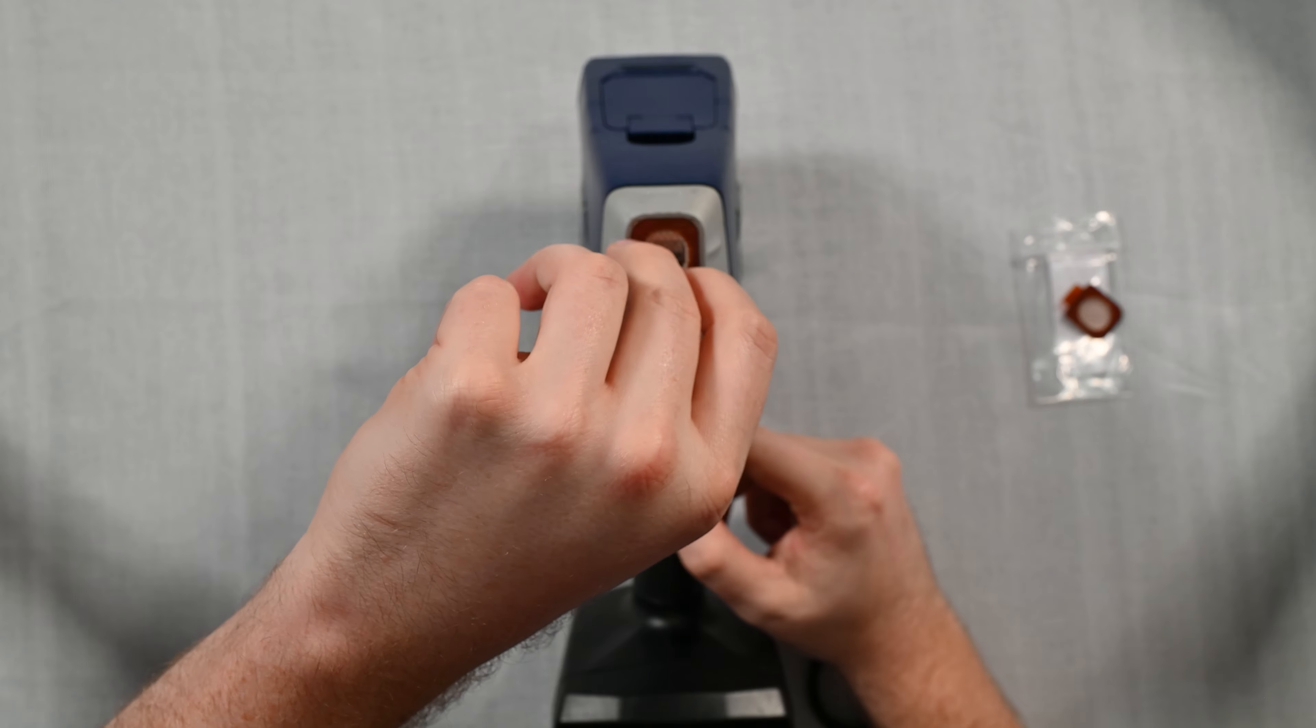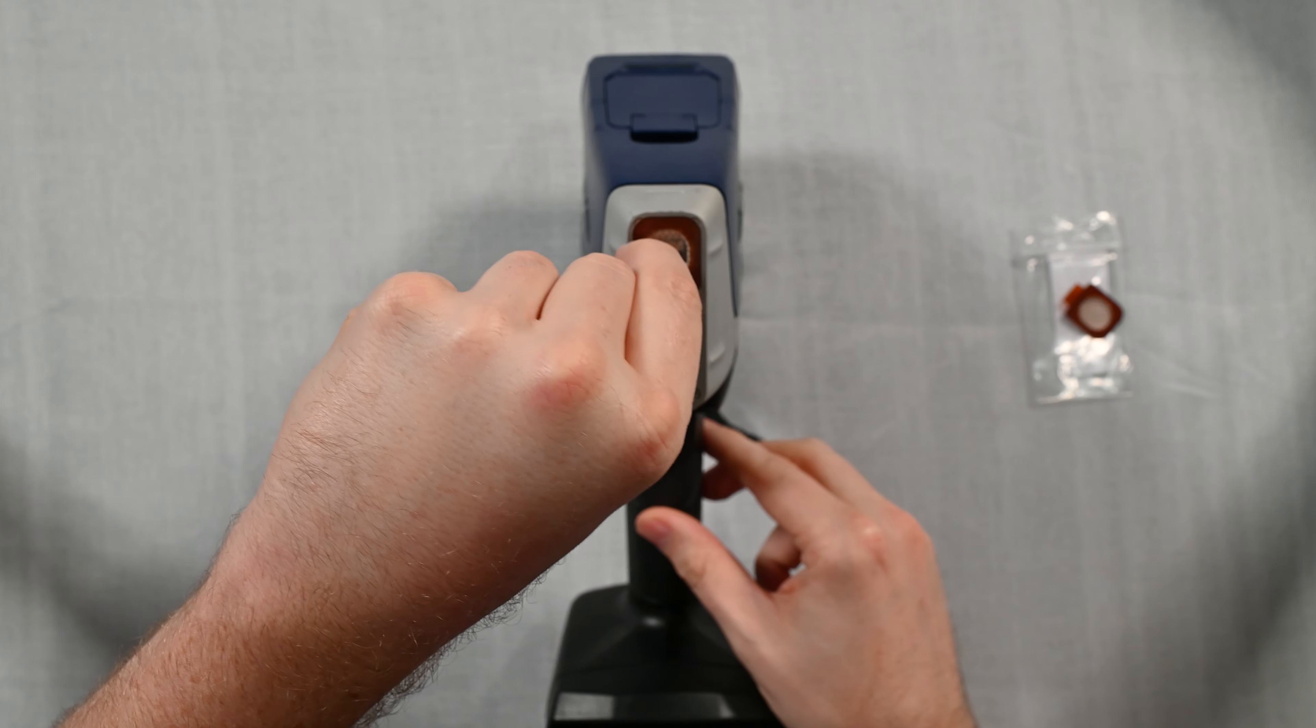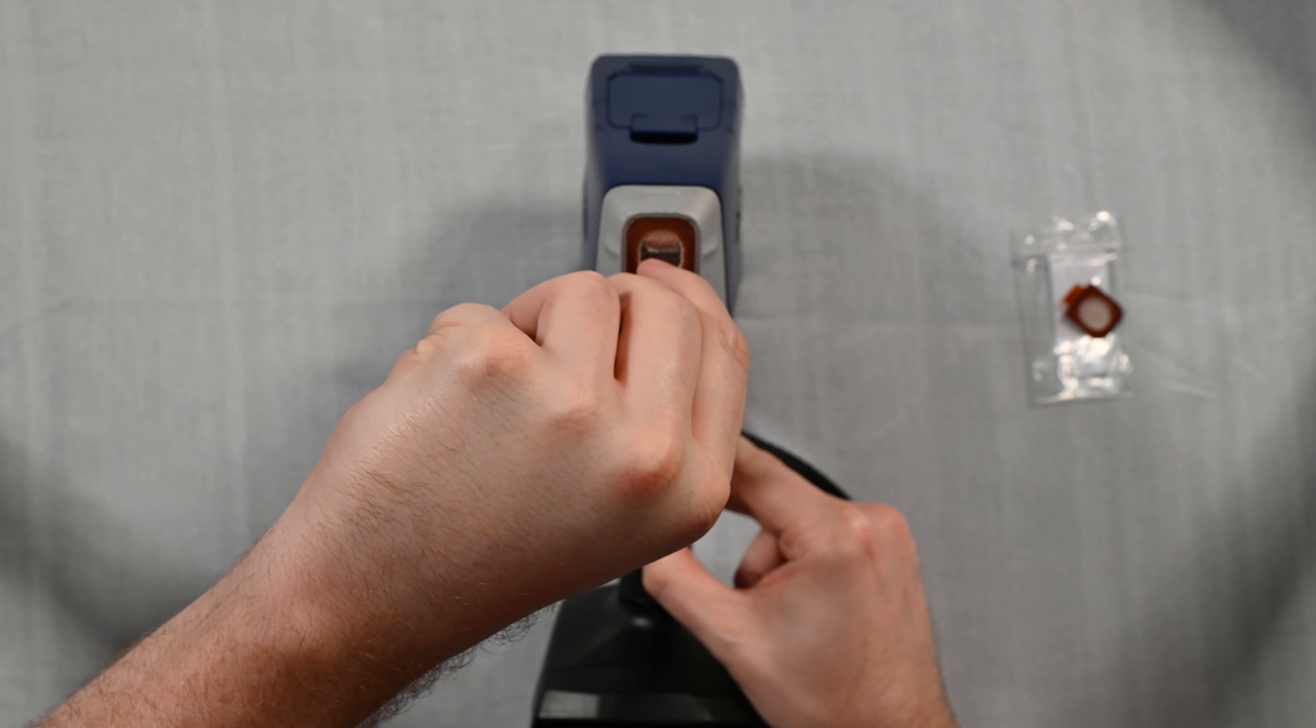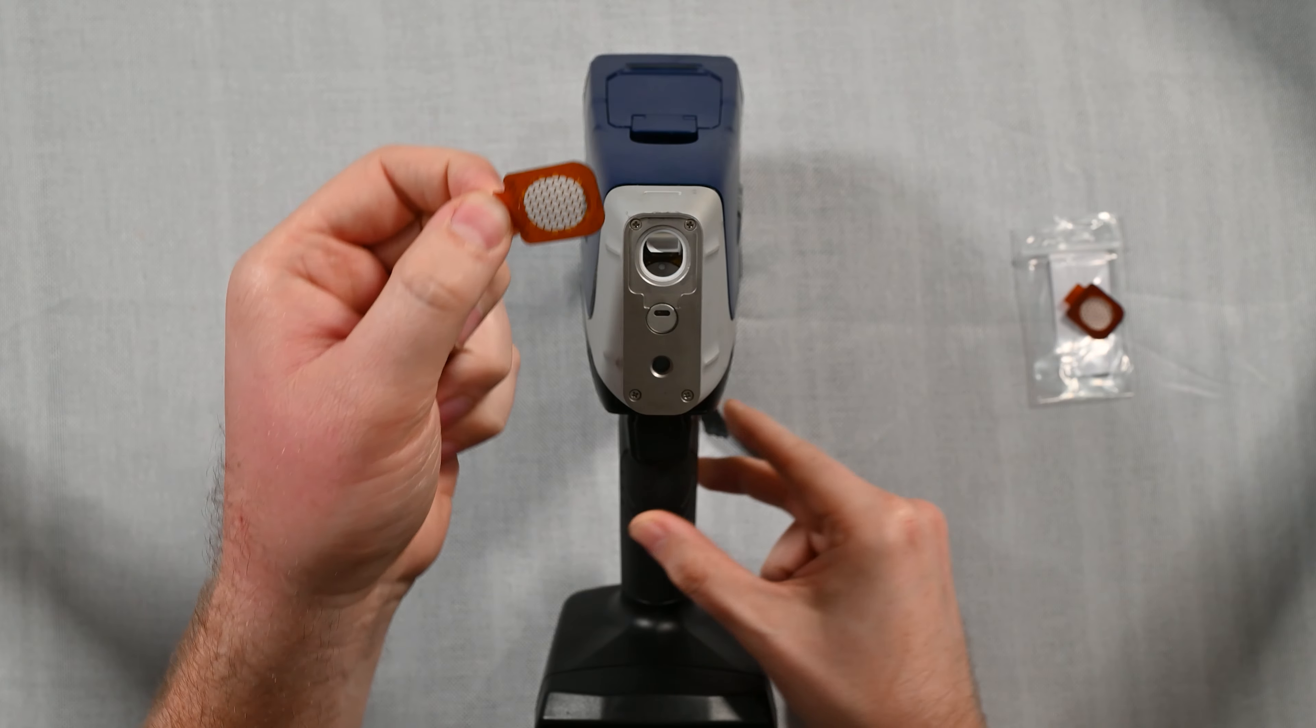All we do is there's a little pull tab on the bottom here. So I'm going to put my fingernail under that pull tab and I'm going to pull the window off. It's just stuck on there with a little adhesive.